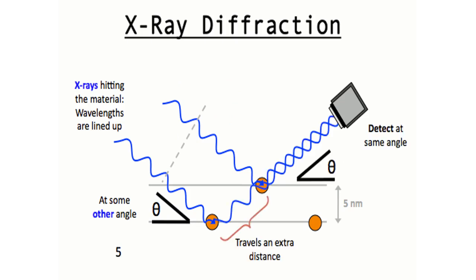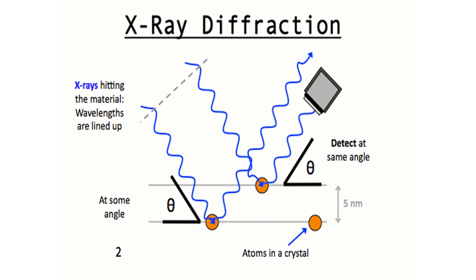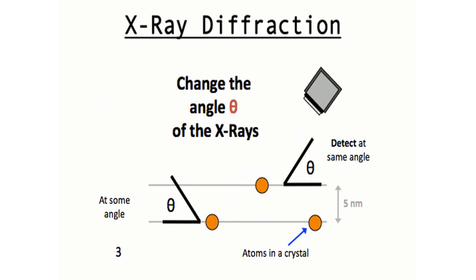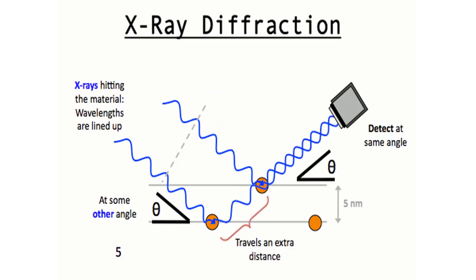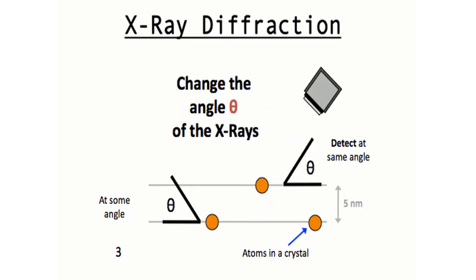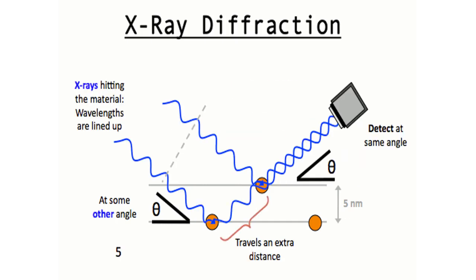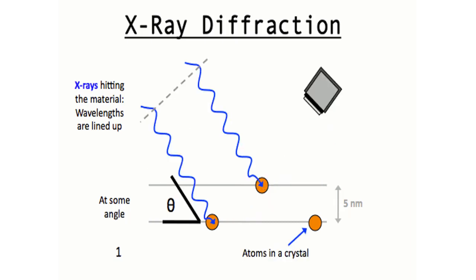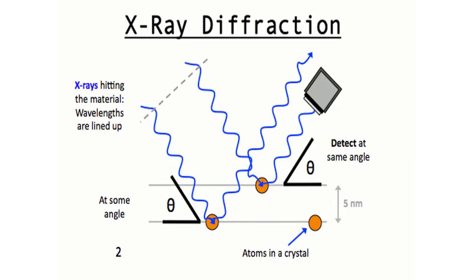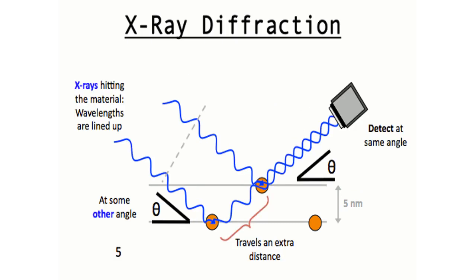Just look, when these rays hit the plane, we should measure the angle of incidence, and when these rays move after scattering, the scattered light angle should also be measured. These two angles will be measured, and after scattering, you can look, these rays can interact either constructively or destructively.